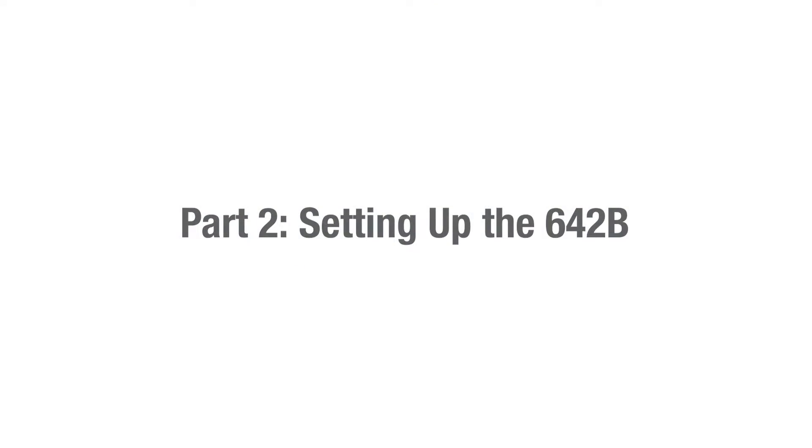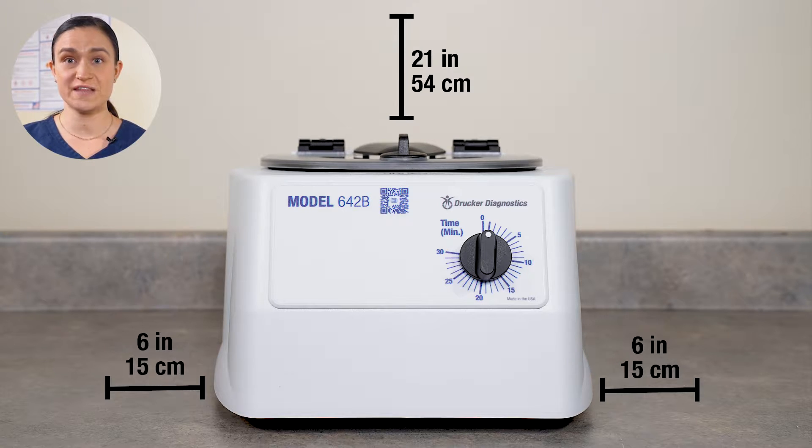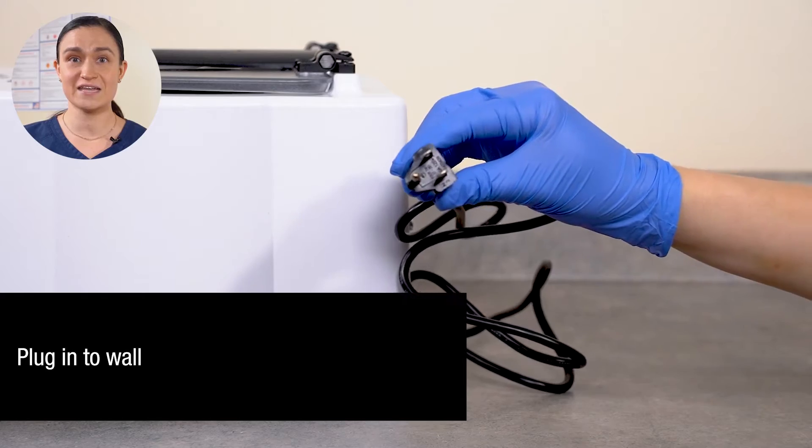Part 2: Setting up the 642B. Let's start by making sure we have all our necessary accessories. These came out of the accessory bag packed in with your centrifuge. You'll need your tube holders and your centrifuge with its attached power cord. If you're missing anything, please contact Drucker Diagnostics. Start by placing the centrifuge on a flat, level, sturdy surface. Leave at least 6 inches (15 centimeters) on all sides and at least 21 inches (54 centimeters) height above the lid so you can easily open it. Locate the power cord on the back of your 642B and plug it into the wall.